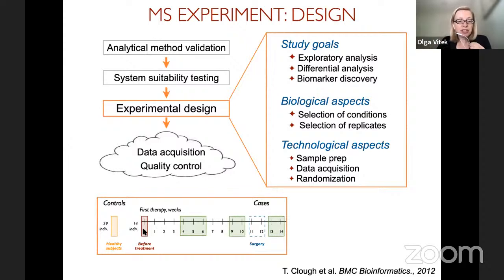And you could ask questions. Which proteins change in abundance between healthy and disease at diagnosis? Which proteins become more similar to healthy levels after the treatment? Which proteins change primarily after surgery? So this is the type of experimental design, the type of questions that MSstats can answer. And again, it requires fairly specialized statistical models to reflect different sources of variation.